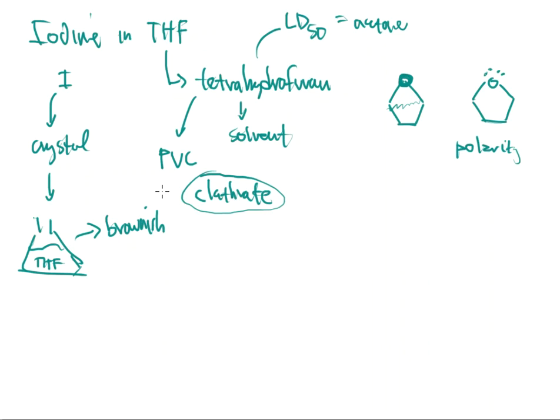So the iodine crystal is non-toxic. It's a shiny crystal, very commonly used in the medical field, not a big issue there at all. It's just the THF that you want to be careful with when you handle it in the lab. All right, so as far as the reaction setup goes, those are my reagents. So how does this setup look?